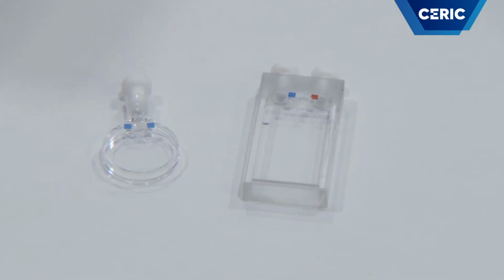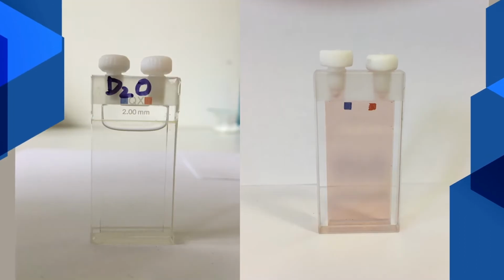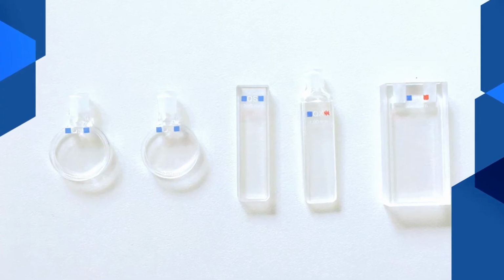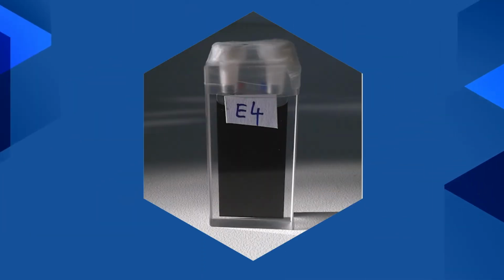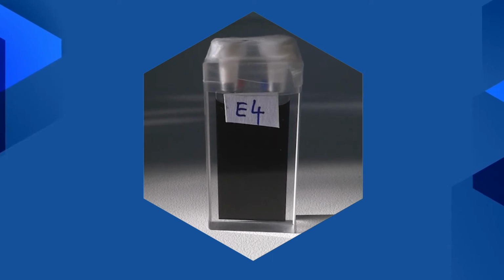There is no need of special sample preparation. The solid samples are simply placed into the neutron beam. For the liquid samples, we use quartz cuvettes of diverse sizes. Powder samples can also be filled into quartz cuvettes or aluminum holders. It is important to note that the quartz, glass, and aluminum holders are transparent to neutrons.